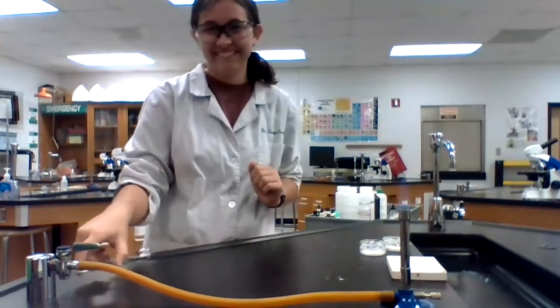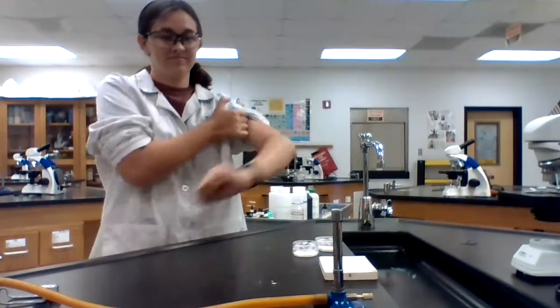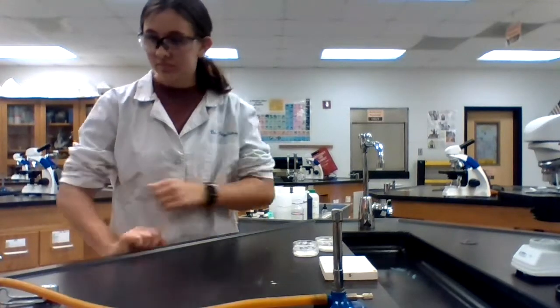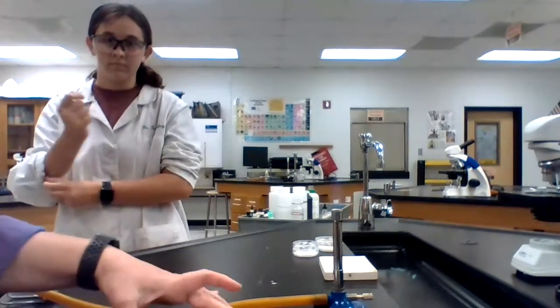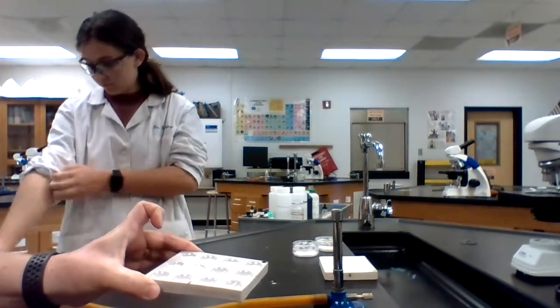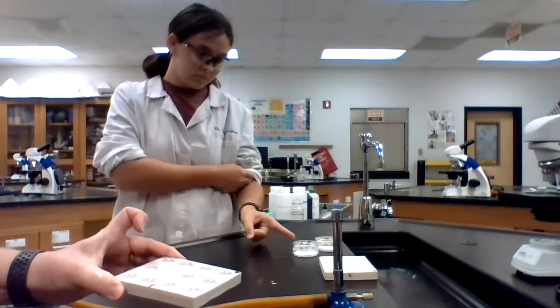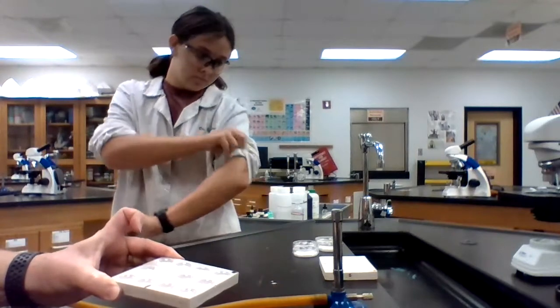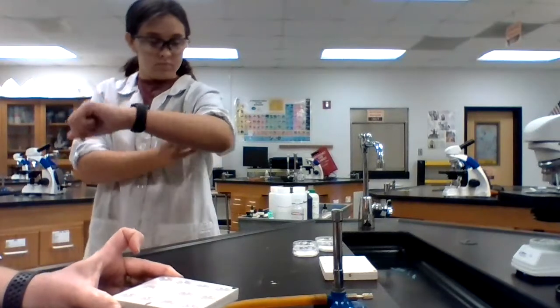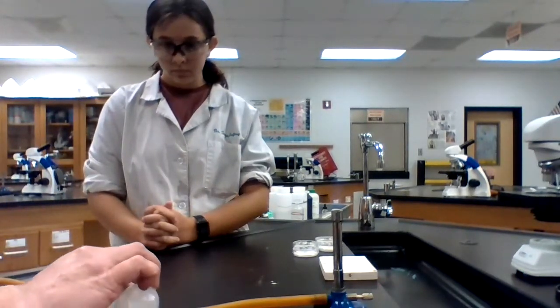All right, so when we light our Bunsen burner, we want it to be a nice blue flame. You'll be able to see that in a little more detail in just a minute. So we have a tray, I don't know if you can see the tray. And then in each well of the tray, we have our known. So we have sugar and salt, potassium chloride, calcium chloride, boric acid, and then zinc chloride, and then we'll have an unknown. So what I'm going to do is add just a little bit of distilled water to each of the wells.